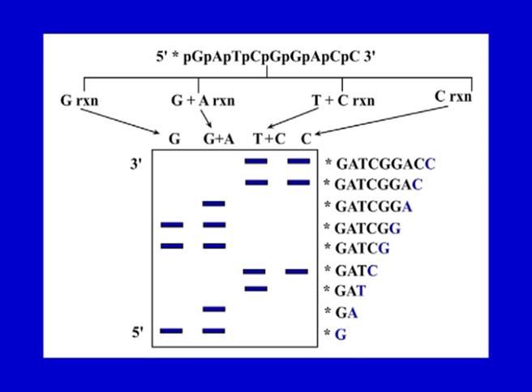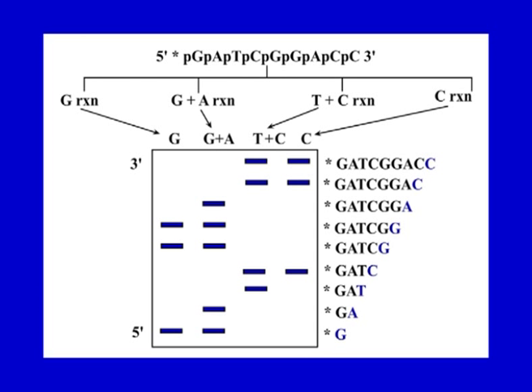Now, remember when the cleavage occurs at the 5 prime side of this G here, earlier we took a sequence which was a little bit different, it was TGT, but just to understand, if it is like here, then there will be only labeled P actually and no base.